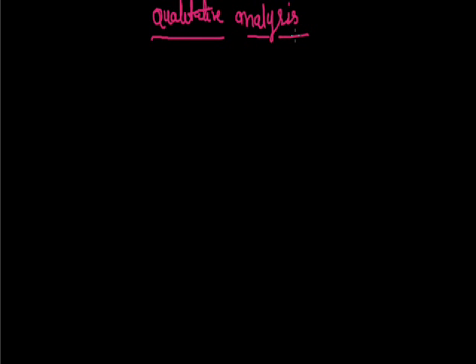In this topic, we already discussed how we can identify cations and anions by using their color, smell, odor, etc. So we are already discussing color. That is the experiment. Next is observation. Third one is inference.